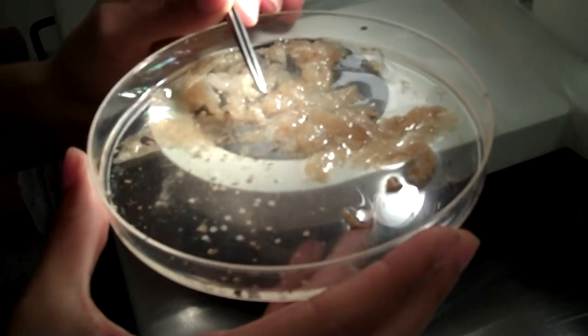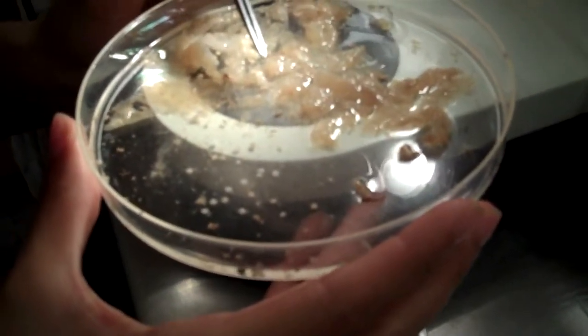Each pellet is different and can contain anywhere from 0 to 700 otoliths. We put the otoliths in slides like these in order to ID them later.